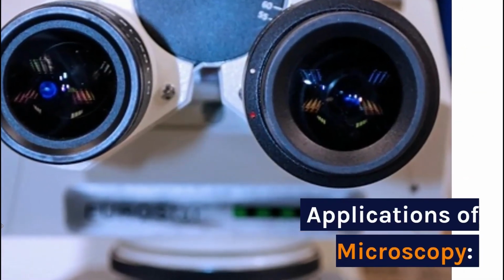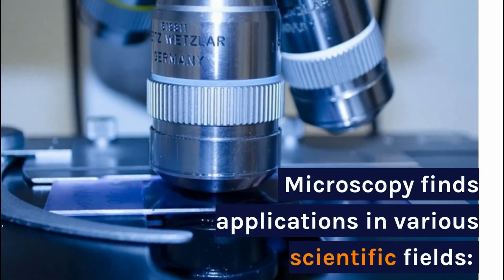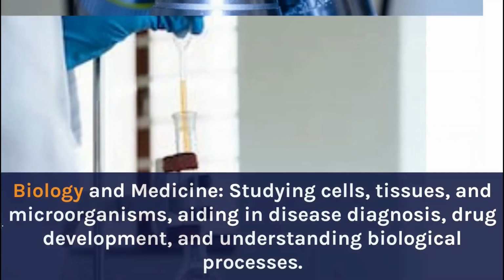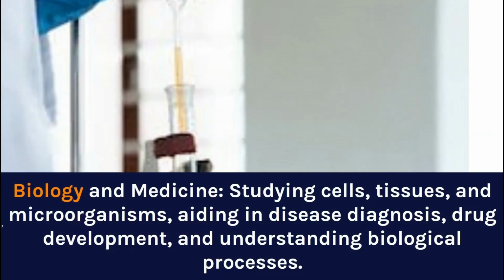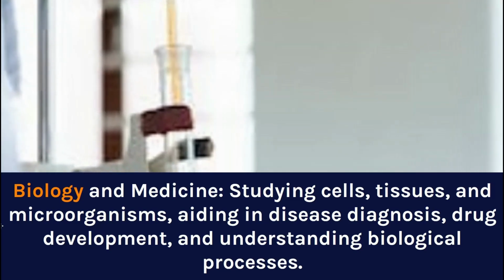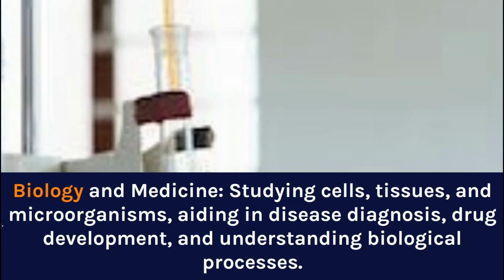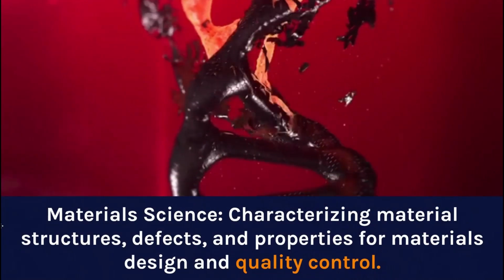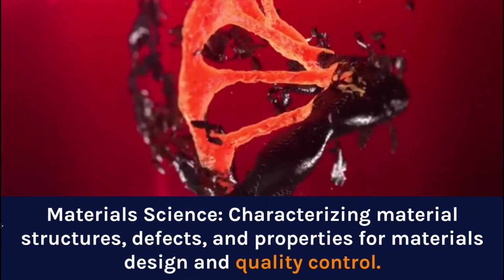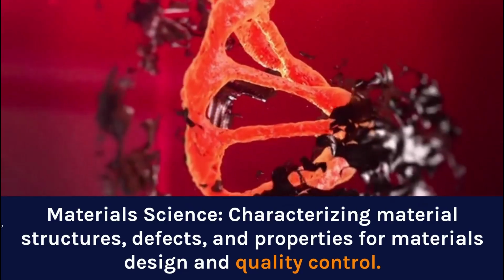Applications of microscopy. Microscopy finds applications in various scientific fields. Biology and medicine: studying cells, tissues, and microorganisms, aiding in disease diagnosis, drug development, and understanding biological processes. Materials science: characterizing material structures, defects, and properties for materials design and quality control.